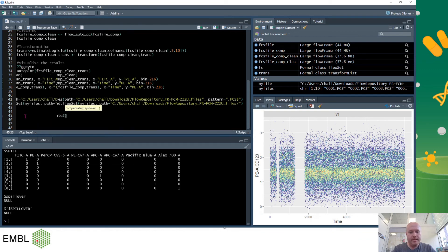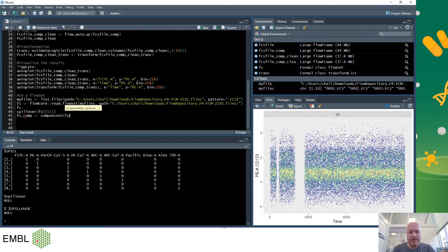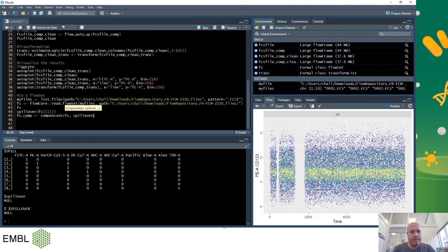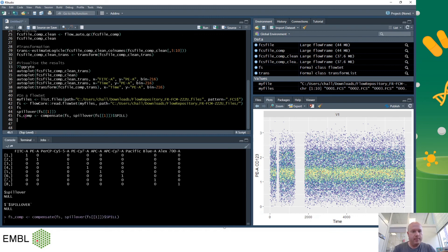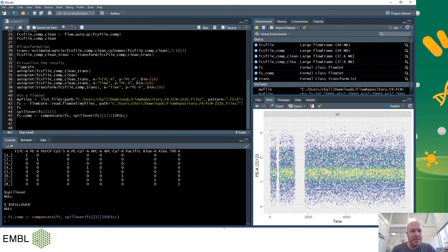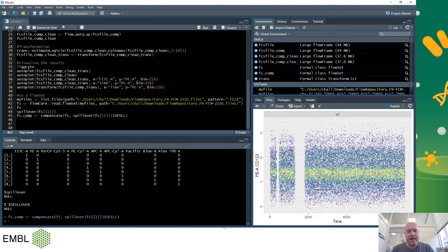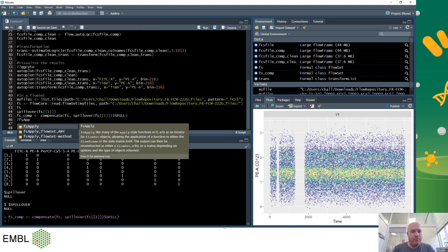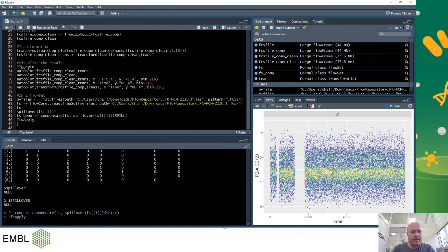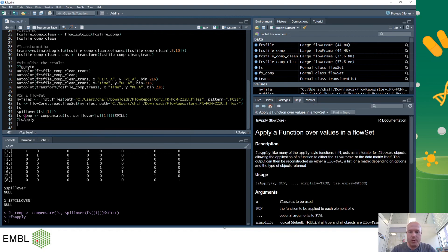And say fs using the spillover from fs number one and the spill keyword and that will apply the compensation to all of them. Now you'll notice that I've only chosen one of the compensations. If you wanted to compensate each file compared to their own you'll have to use a command called fs apply, which is an incredibly powerful command in flowcore but we're not going to cover it here but it's something that you should definitely look into when you get a bit better.